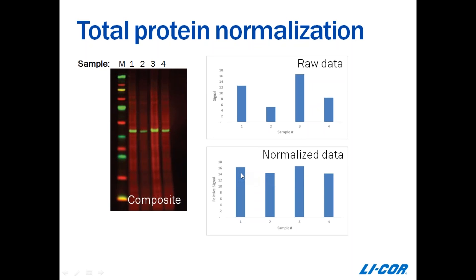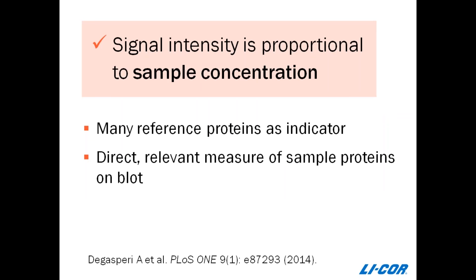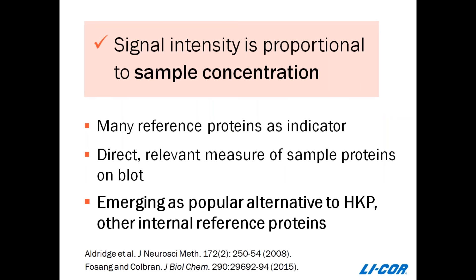This experiment shows total protein staining in action. Four different NIH 3T3 cell lysate samples are loaded on this blot, incubated with protein stain to generate an image used to quantify total sample protein in each lane. Then the target protein ERK was detected on that same membrane by Western blotting and quantified. The raw data show a range of signal intensity, but normalization to total protein staining really clarifies the meaning of those results — correcting for the inconsistent sample loading reveals that the target protein levels are actually pretty stable in these samples.